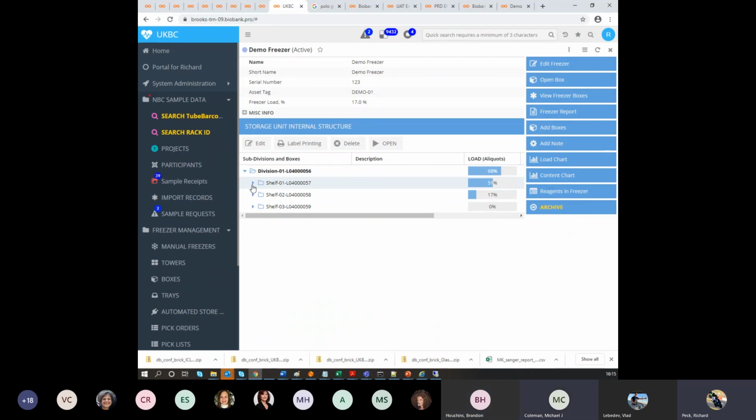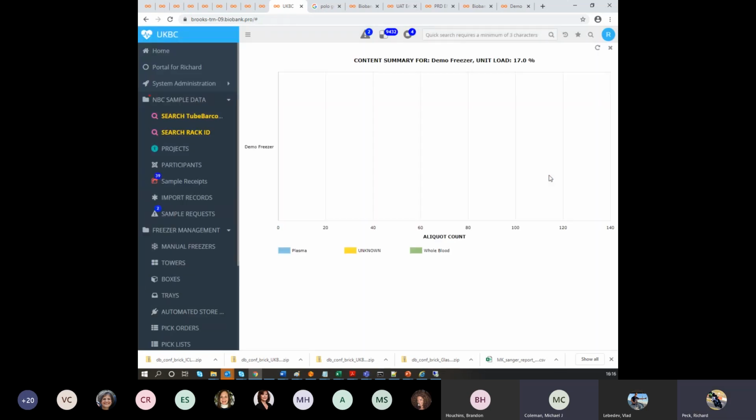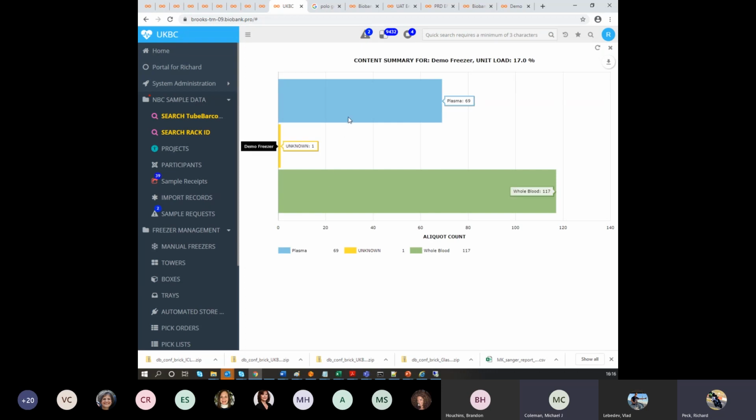Correct. I was just curious, is the automated store interfacing with other systems as well as this LIMS, or is this the sole system it interfaces with? Oh, sorry. In this case, for this customer, we are still running both LIMS systems in parallel, so we can interface with multiple LIMS systems if it needs to. This is whilst we're migrating the data into Biobank Pro and cleaning it up. As you can imagine, when they have around 12 million samples, it's quite a lengthy process. So in this case, this store integrates with two different LIMS systems. I bring it up because it's kind of a unique situation where one device is used by many LIMS, and it's kind of interesting. It's been challenging. Thanks very much. Very nice.